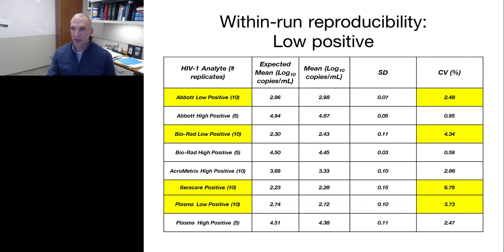And again, as you can see highlighted on the right, there are some differences between the products, but overall, both with the low positive controls seen here and with the high positive controls seen here, there isn't any real difference in my mind between those.